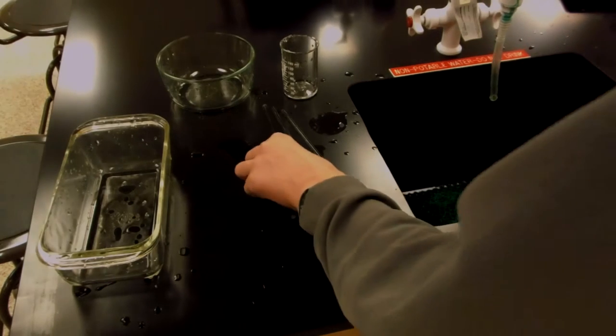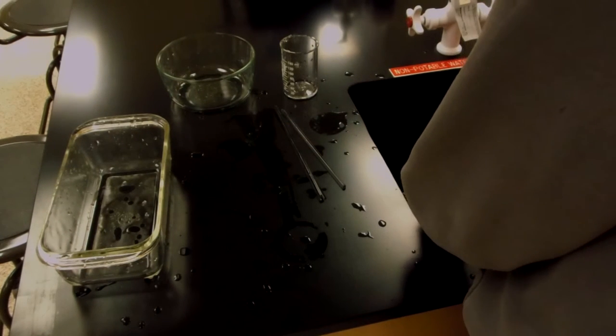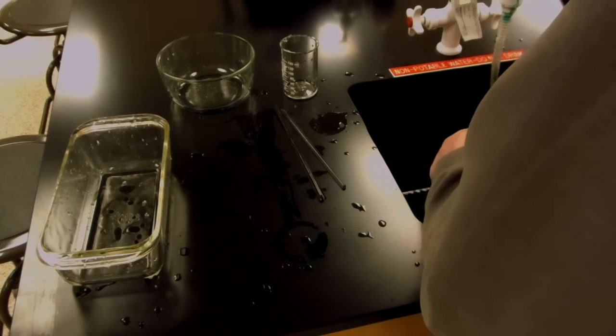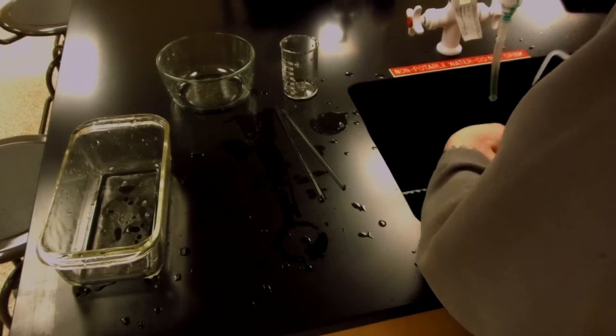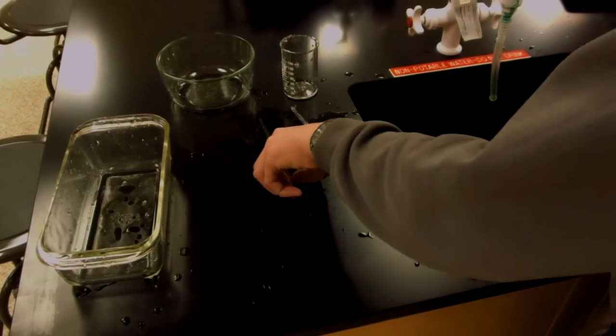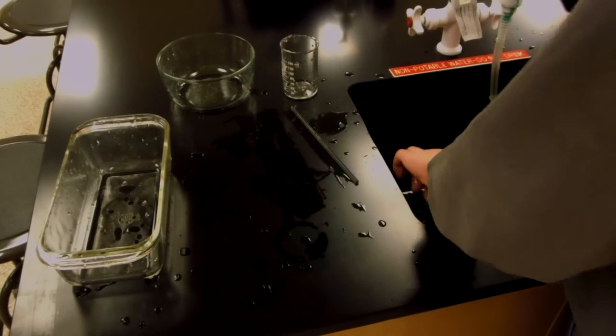Now I will clean the glass stirring rods. First I rinse with water and spray on the aqueous solution onto the rods. It's as simple as that, as there are no inner surfaces to worry about. Apologize for the dog in the background, but anyway. So I repeat on the second beaker.